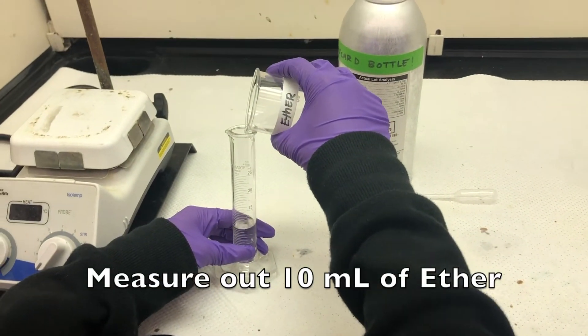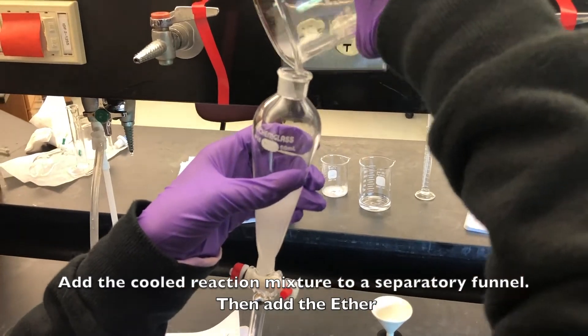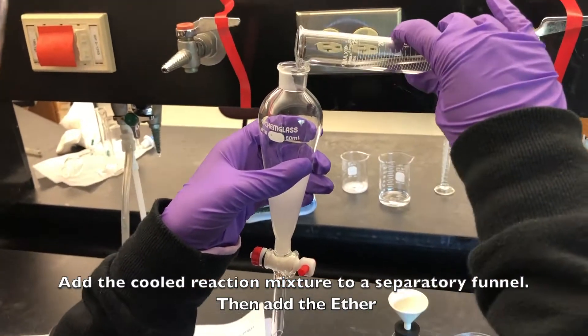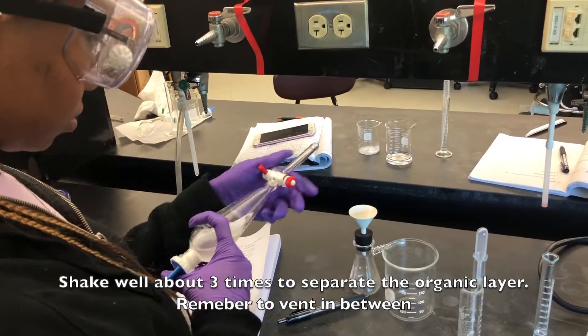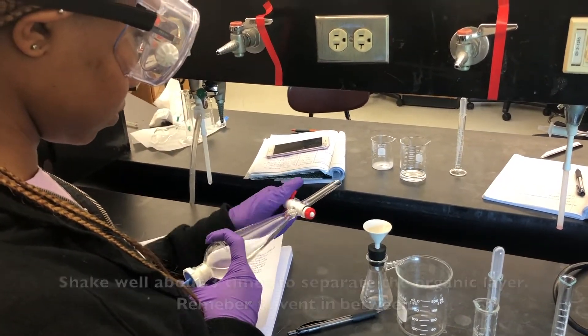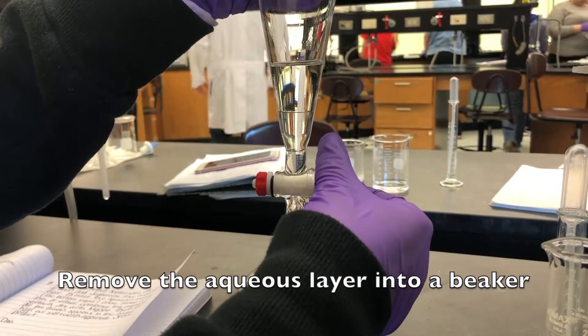Measure out 10 milliliters of ether. Add the cooled reaction mixture to a separatory funnel and then add the ether. Shake well about 3 times to separate the organic layer and remember to vent in between. This is how the layer should look. Remove the aqueous layer into a beaker.